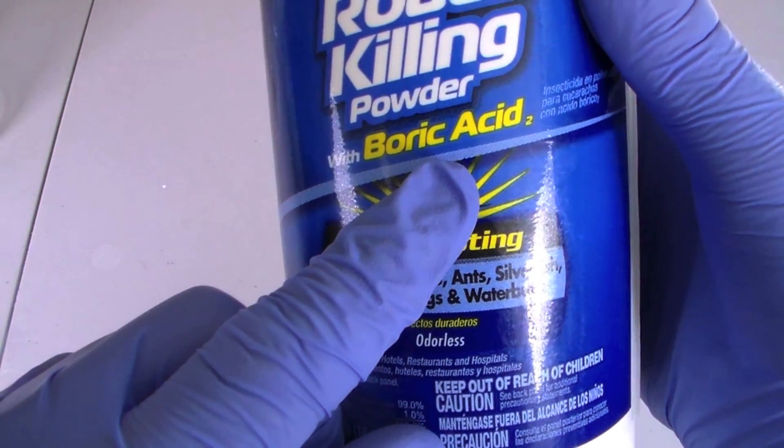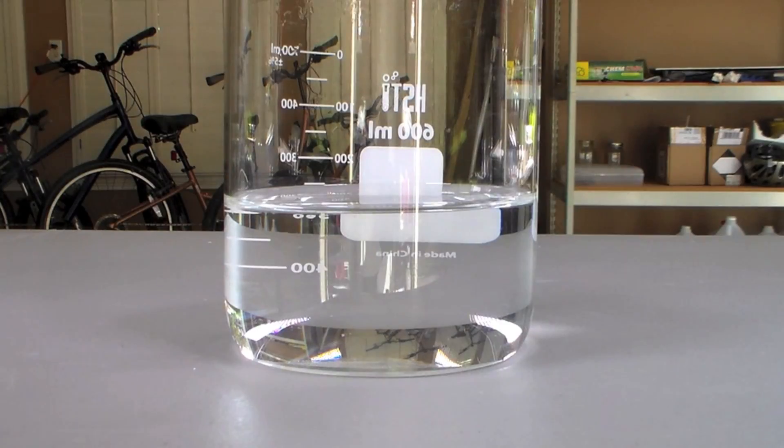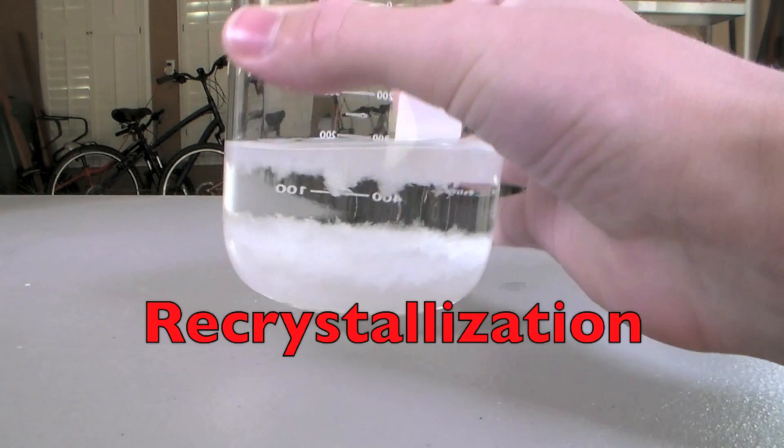99% boric acid can be bought as roach killer at hardware stores. To remove the small amount of impurities, we will carry out what is known as a recrystallization.